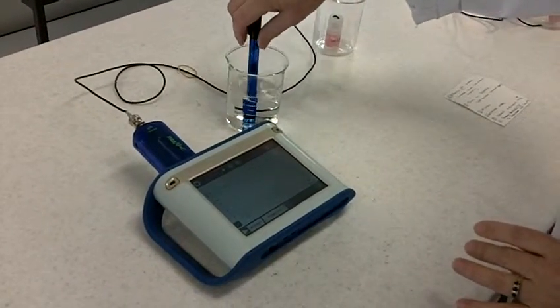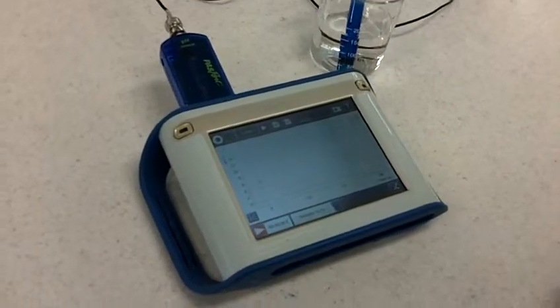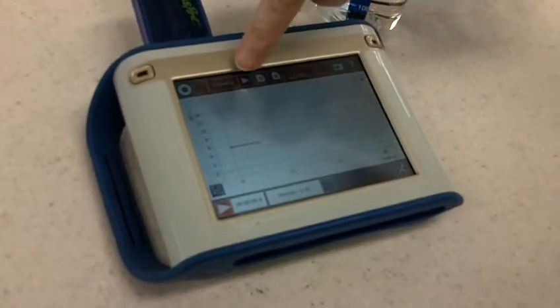When you wish to take your reading, place the probe in the creek water and press the green arrow for a digital readout. Press the arrow next to the graph.